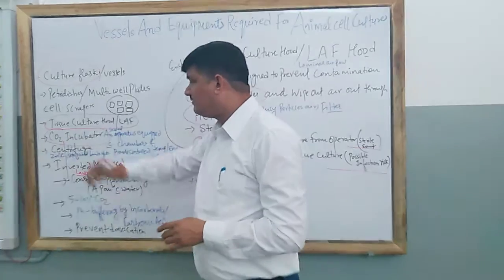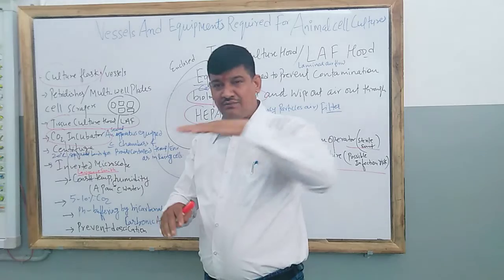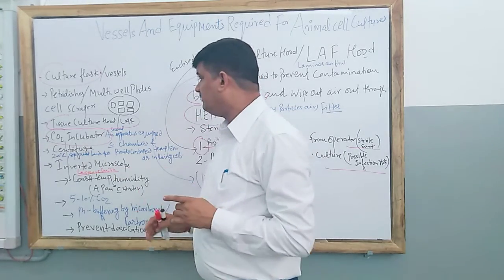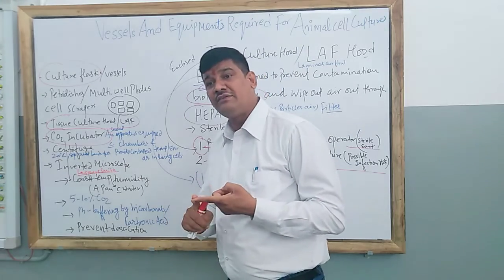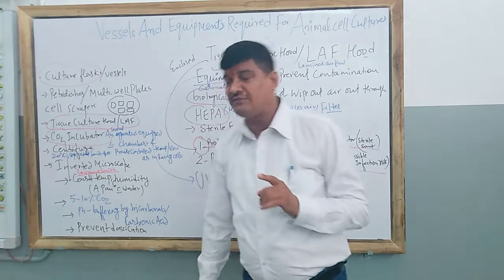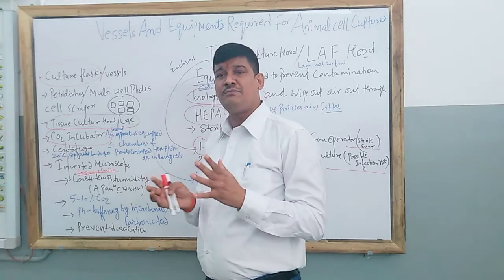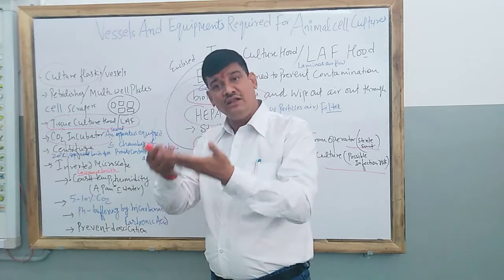And if you are asking about the CO2 incubator, there are multiple chambers, and in those multiple chambers we are using carbon dioxide. So 5 to 10% of carbon dioxide is added in that CO2 incubator, and the main purpose of the CO2 incubator is that it provides the controlled temperature and environment as it is found in the living cells.